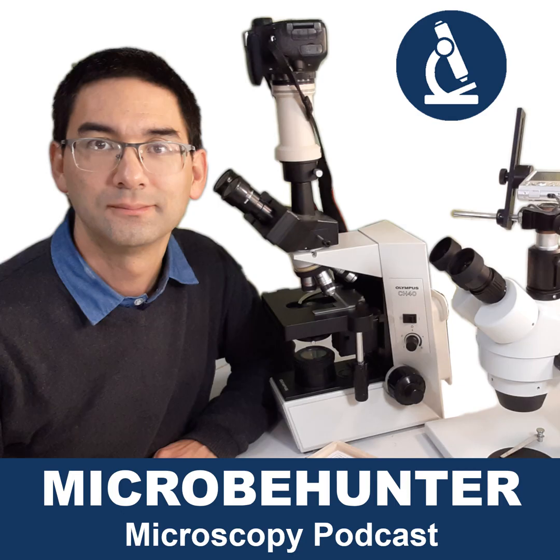Sometimes, for example, bacteria basically have a very low color contrast. They have a refractive index which is a little bit different than the surrounding water. And even if you do not use any optical staining, if you use a regular bright field microscope, you're still able to see them. Not quite as well, but you're still able to see them because of the difference of refractive index. You're able to see so-called diffraction patterns. And what you actually will see then in the microscope is basically a diffraction pattern of the bacterium. And this basically allows you to see it, even though it is not stained and it's transparent, and even though you do not have any special optics.